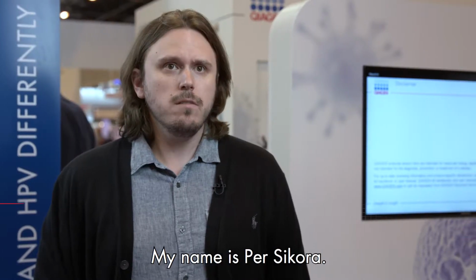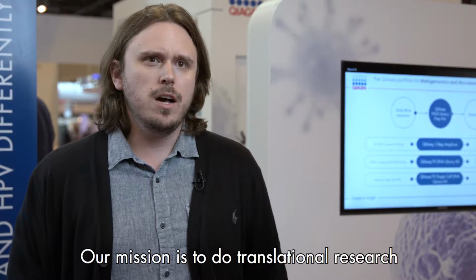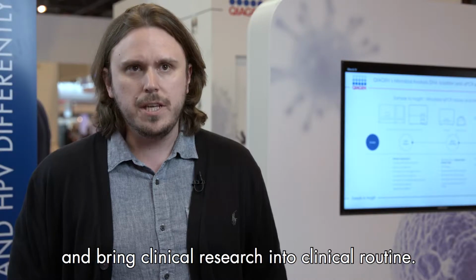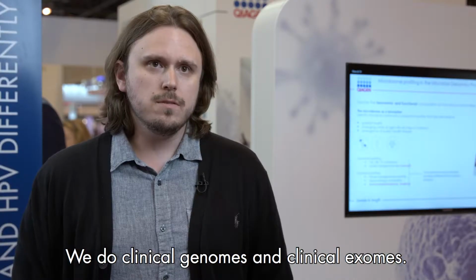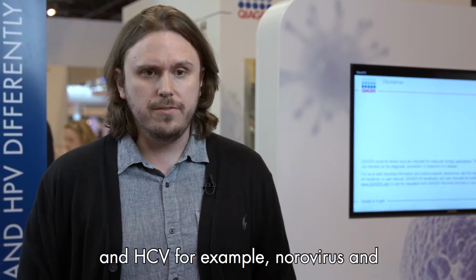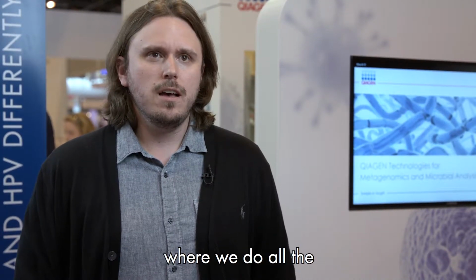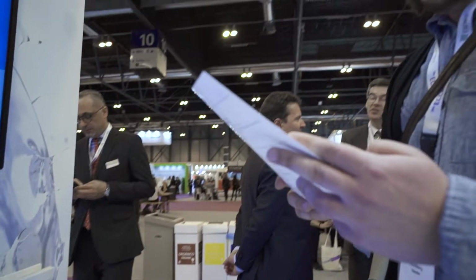My name is Sikora. I'm head of facility at Clinical Genomics Gothenburg, and I'm head bioinformatician at Gothenburg University Hospital. Our mission is to do translational research and bring clinical research into clinical routine. We do clinical genomes and clinical exomes. We also do microbiology, so we do MRSA and HCV, for example, norovirus, and a couple of other whole genome sequences, where we do all the automated analysis through CLC.